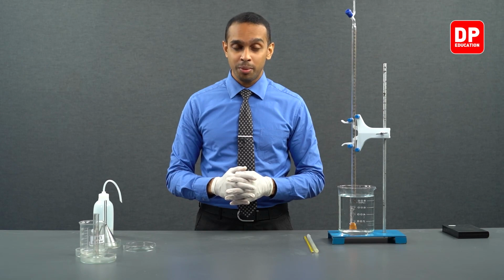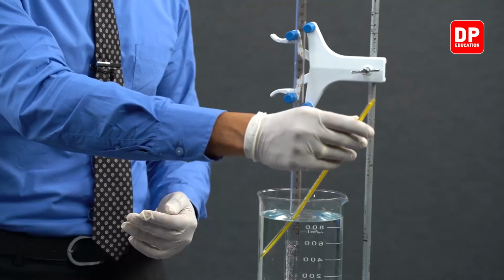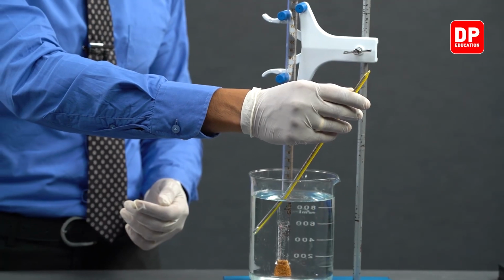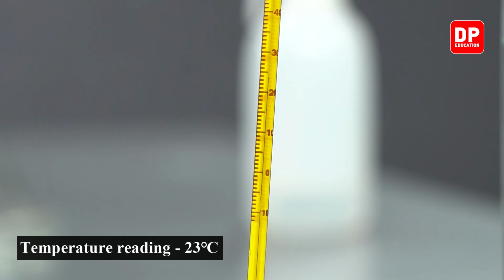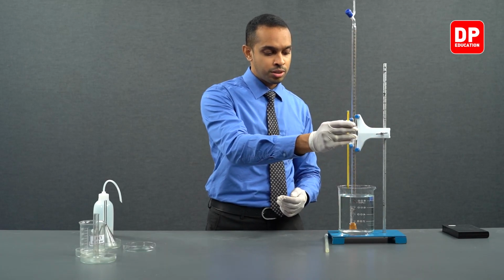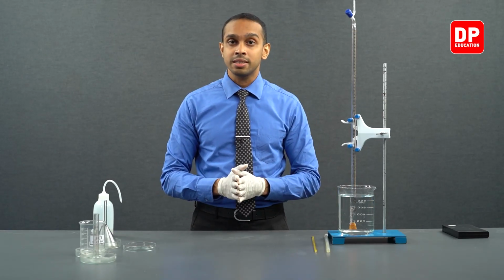Let's take a look at the temperature. We have our thermometer here. We will place it in the water beaker, and the temperature is at 23 degrees Celsius, as in the previous two trials. In the first two trials as well, we had a temperature of 23 degrees Celsius.